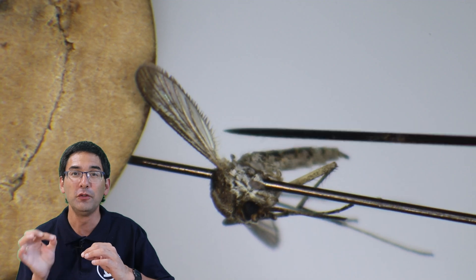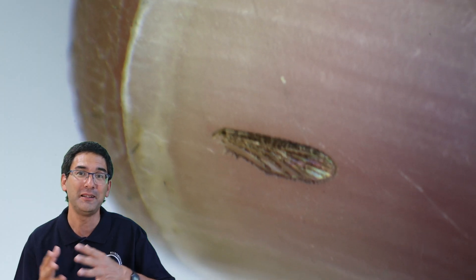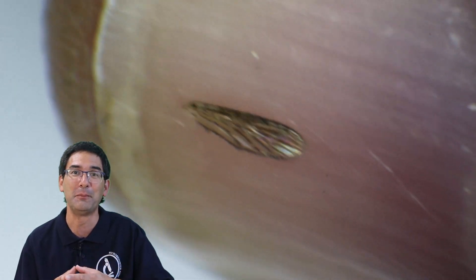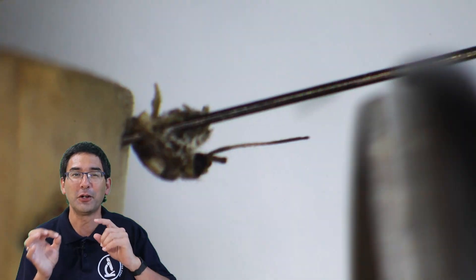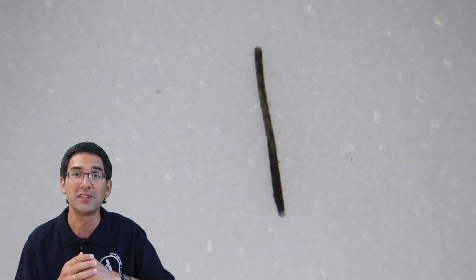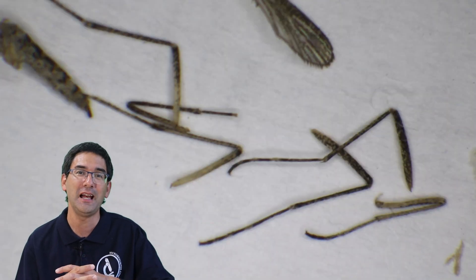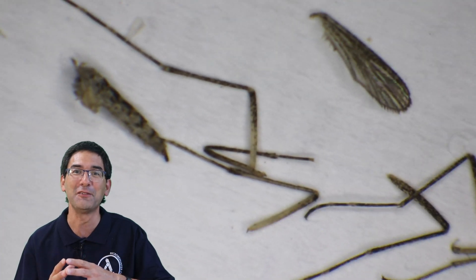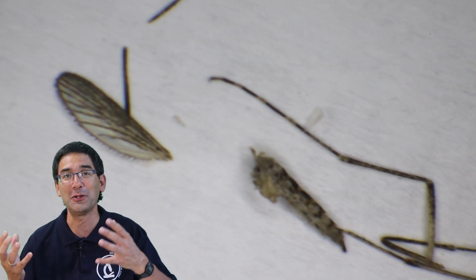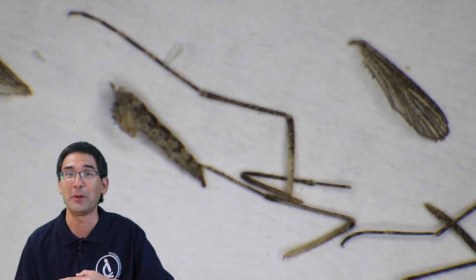I extracted the legs by carefully moving them with a needle. By moving a wing back and forth sufficiently long, the wing breaks off — this works because the insect is relatively dry, and the legs fell off quite easily too. One of the wings ended up on my thumb, and I had to carefully collect it — you've got to be careful not to breathe on it, otherwise it's gone. Here I am cutting off the proboscis with scissors because that one didn't want to come off. Here are all the parts of the mosquito laid out on a piece of paper, ready to make a permanently mounted microscope slide.